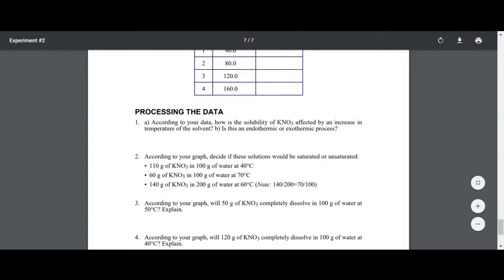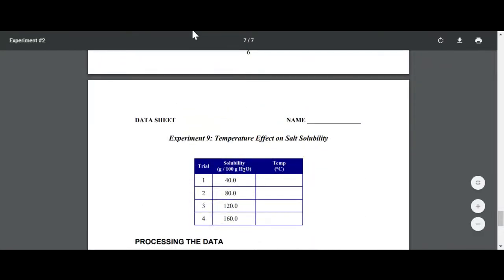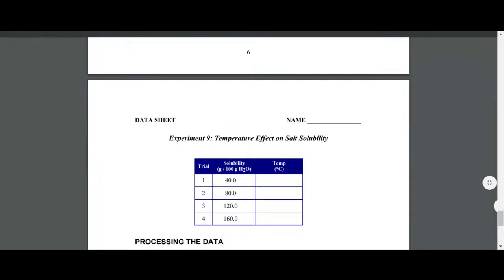Label test tubes 1 to 4. Perfect. So I'm going to stop this so you can see the video. There's no unless, we have to do that. So I stopped the video. I stopped sharing the other screen. So I'm going to depend on your procedure.